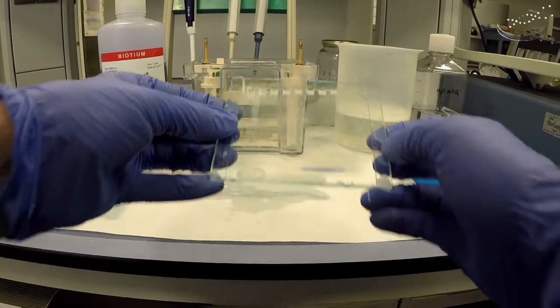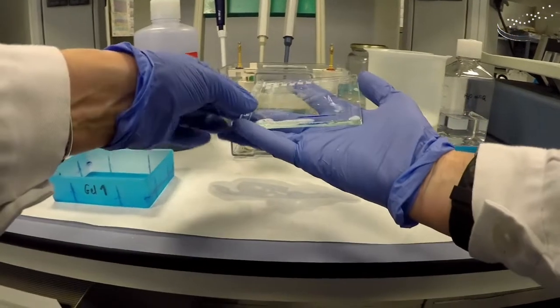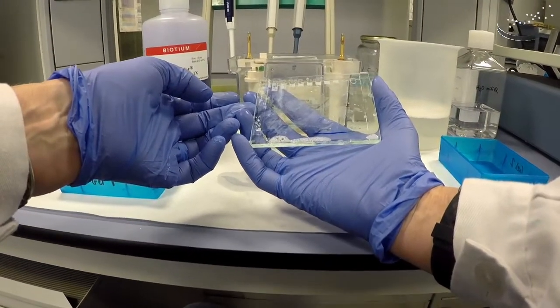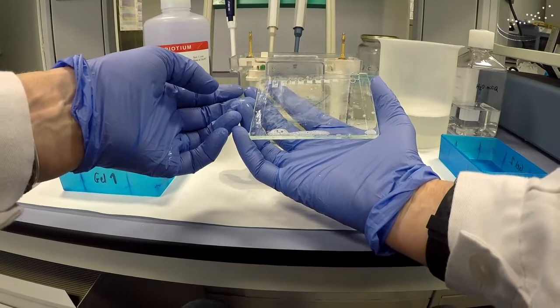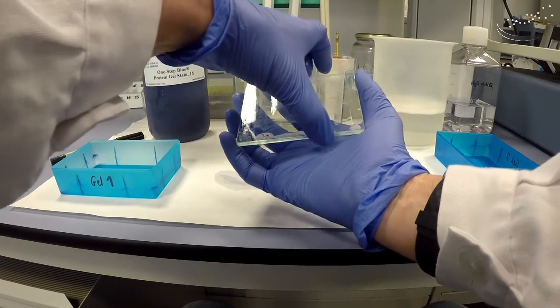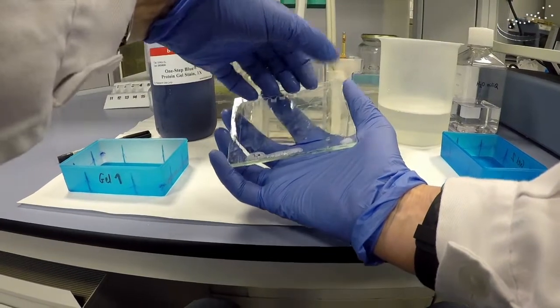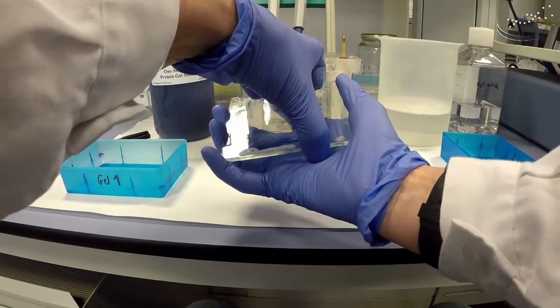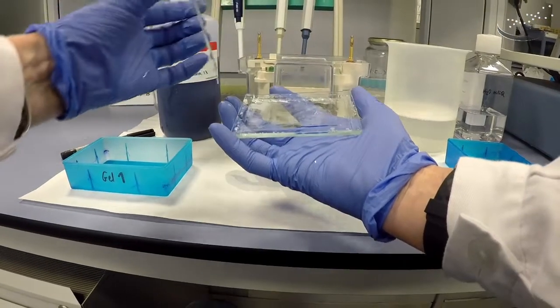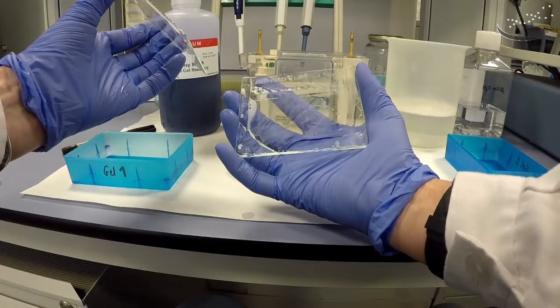Now we need to remove the gel from between the two glass plates. You can do this several ways — there's a spatula that comes with the BioRad system, or you can just use your fingers. You get in between the two plates and pull up, then take off the top plate — the small plate — and then we have our gel.